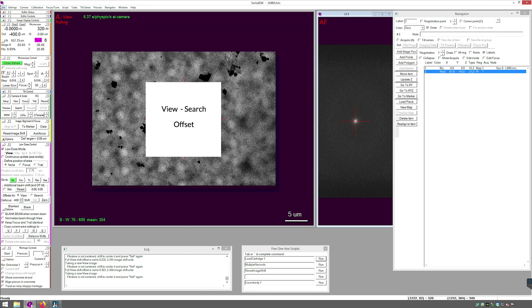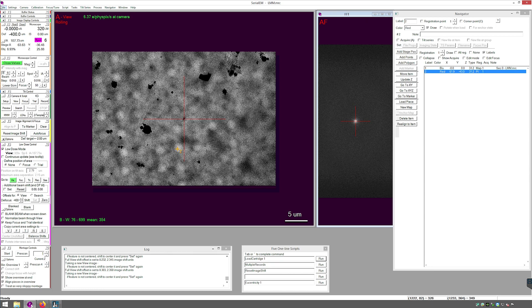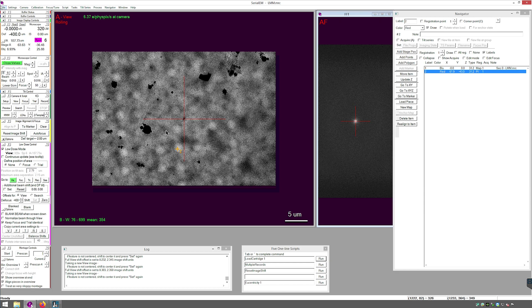The view to search offset is a calibration that, just like the record to view offset, but it's for squares. This ensures that if you click the center of a square to collect a MMM at, it will start at the center. That's the accuracy you're looking for. So what I'll do is I'll center the stage in view on a large feature.